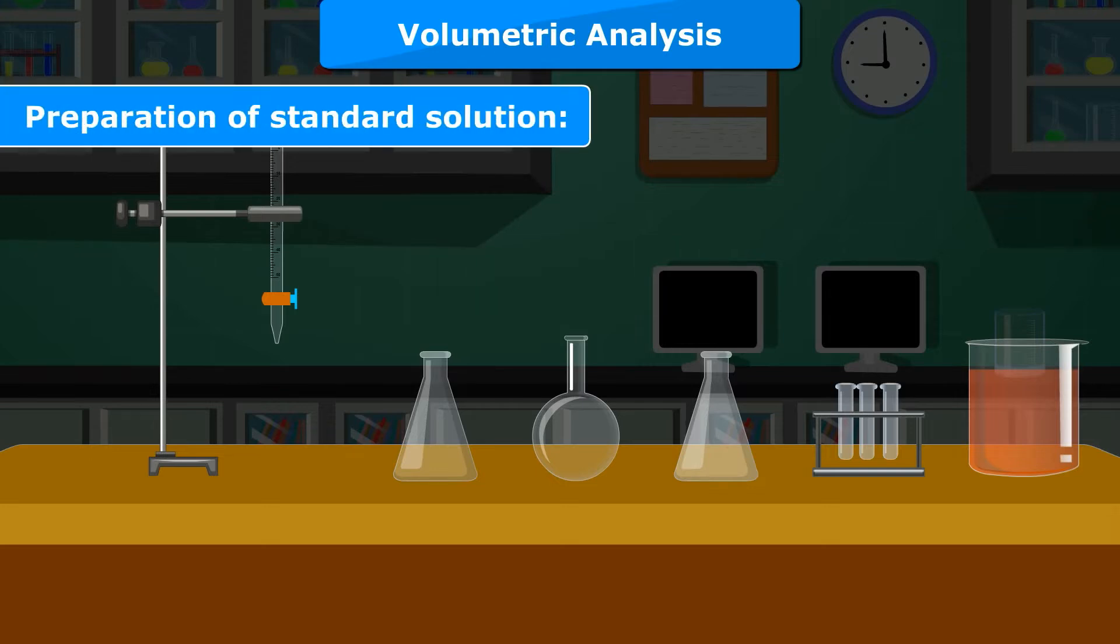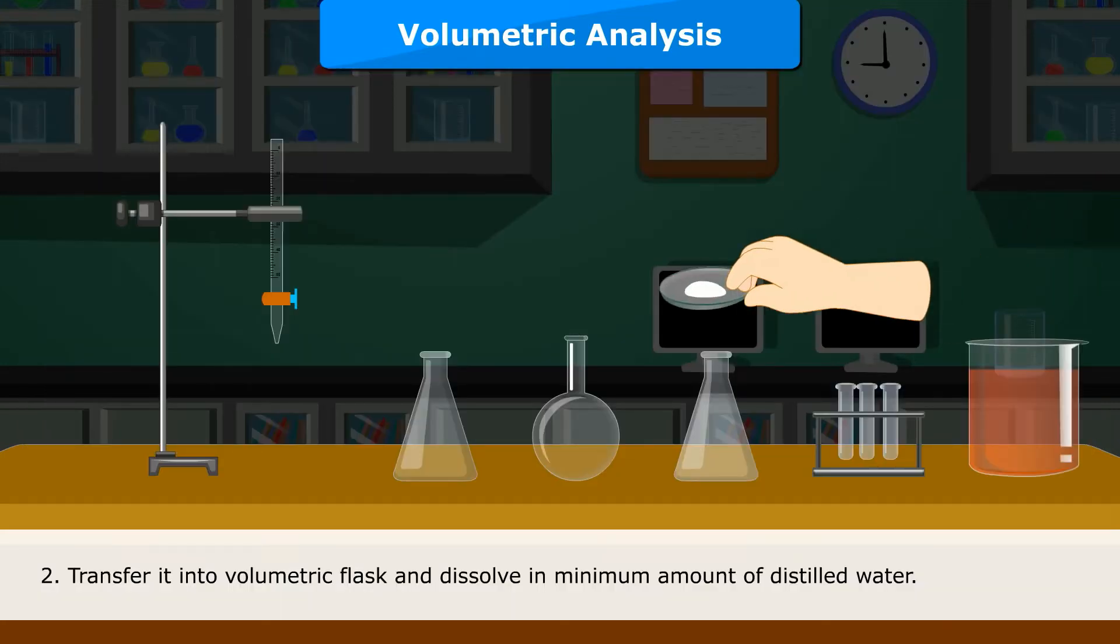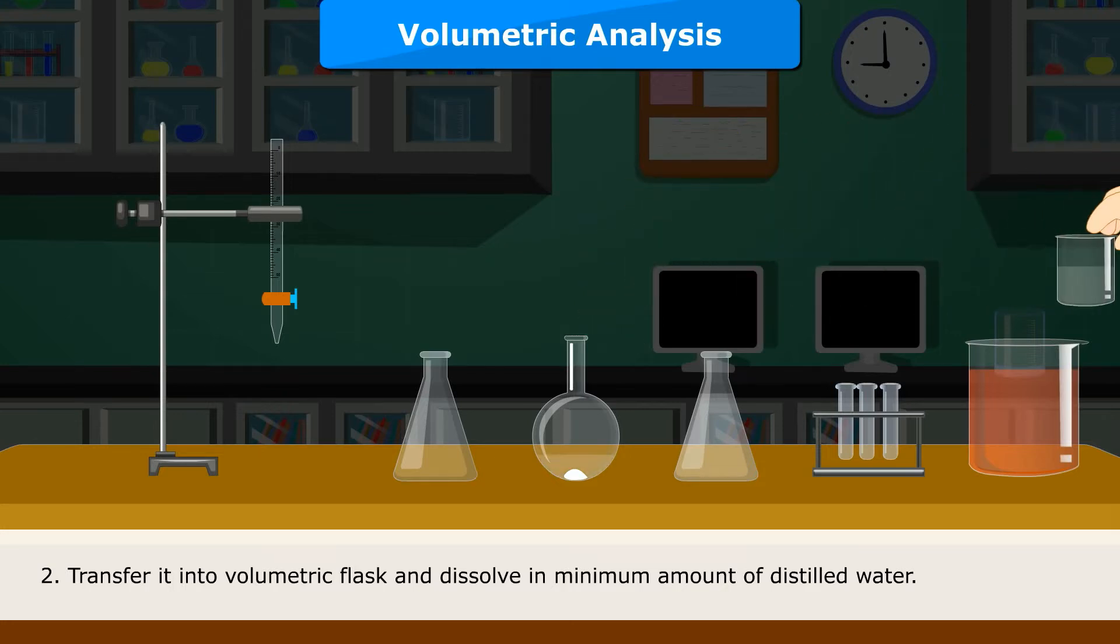Preparation of Standard Solution: Measure and weigh exactly 0.63 gram of Na2CO3. Transfer it into Volumetric Flask and dissolve in minimum amount of distilled water.